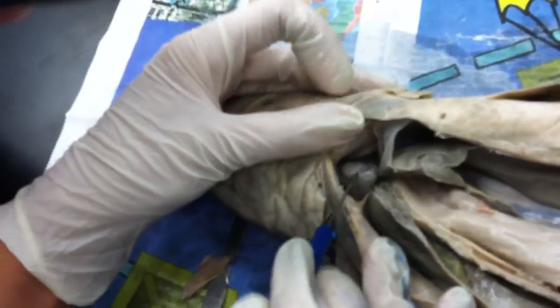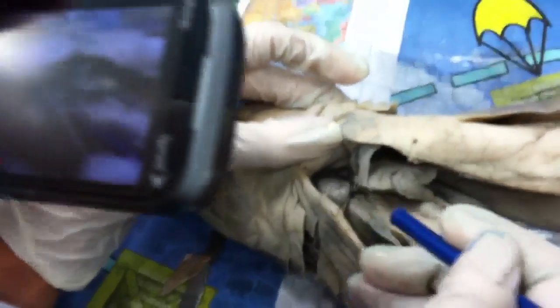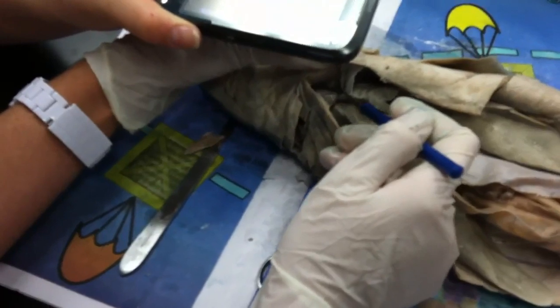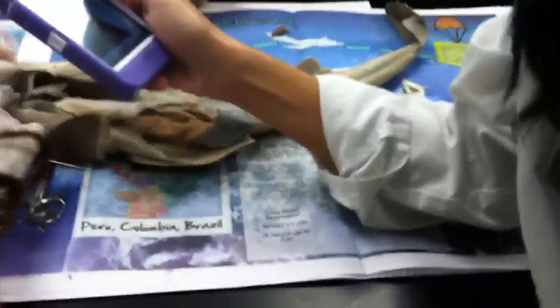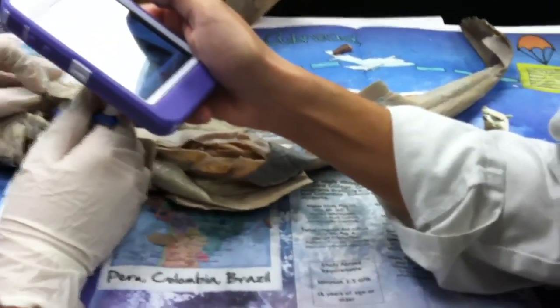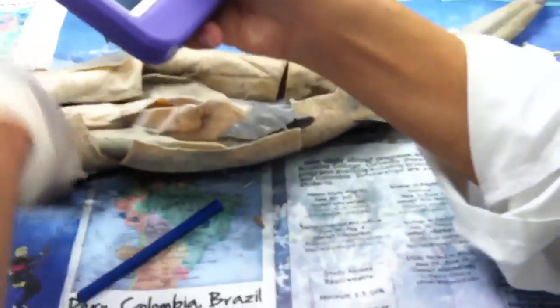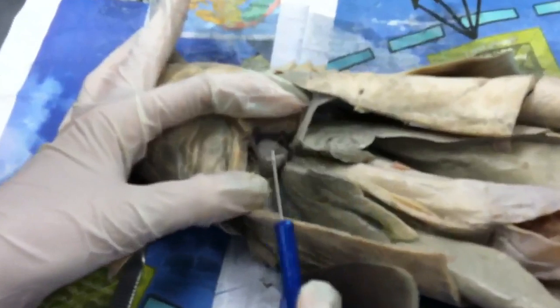Heart is in here. The lighter one is the ventricle and the darker one is the atrium. Ventricle and atrium — there's a darker one below, that's the atrium. You can get a different one if you want for a better view. Ventricle and atrium — the atrium is on the bottom.